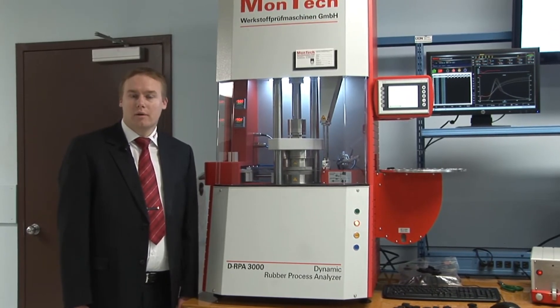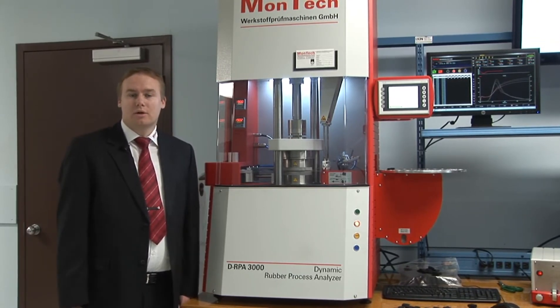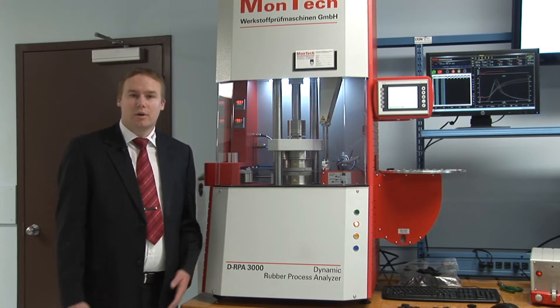In dynamic testing mode, you can run isothermal and non-isothermal tests, strain or frequency sweeps, matrix tests, relaxation, retardation, as well as many more test sequences in any combination.